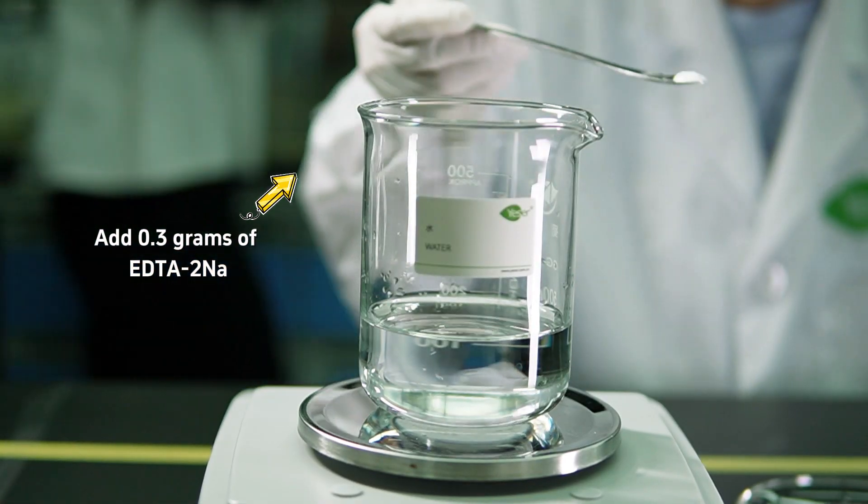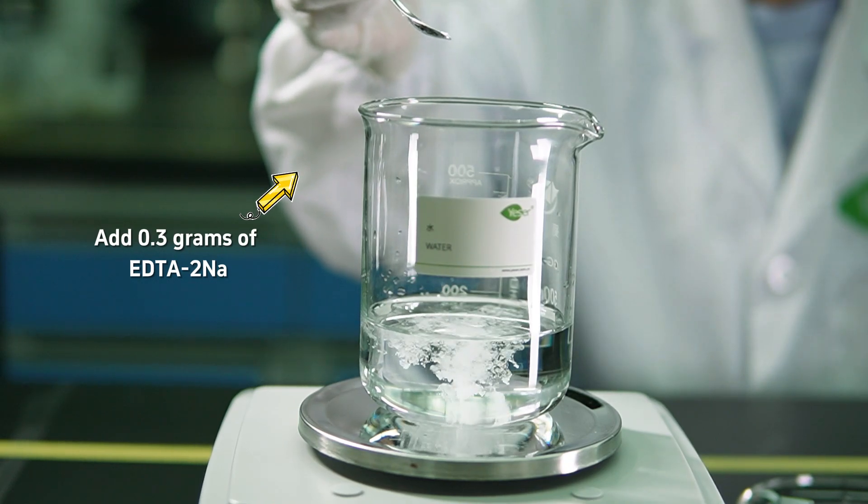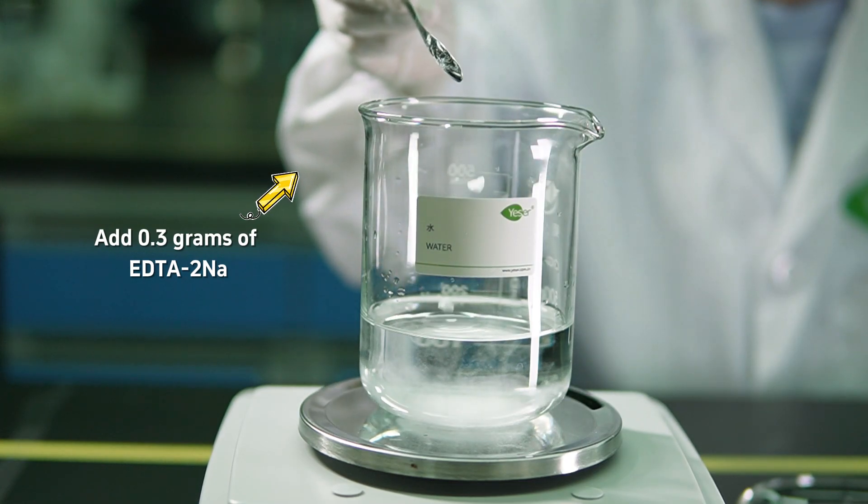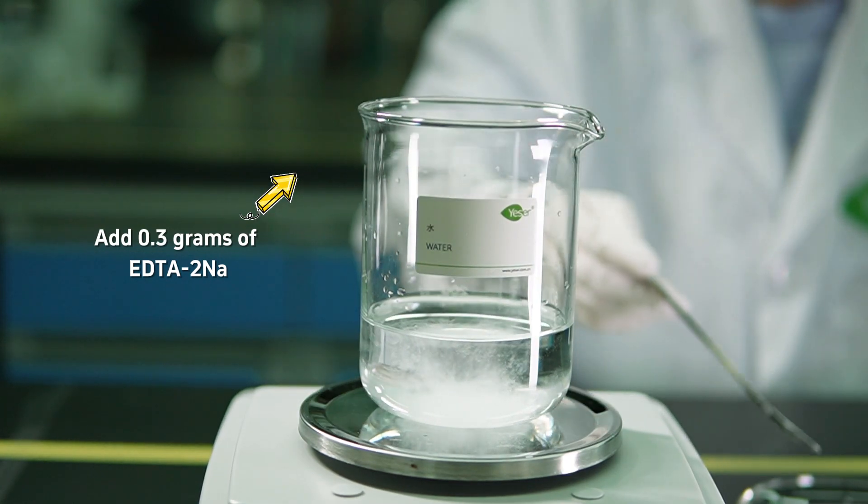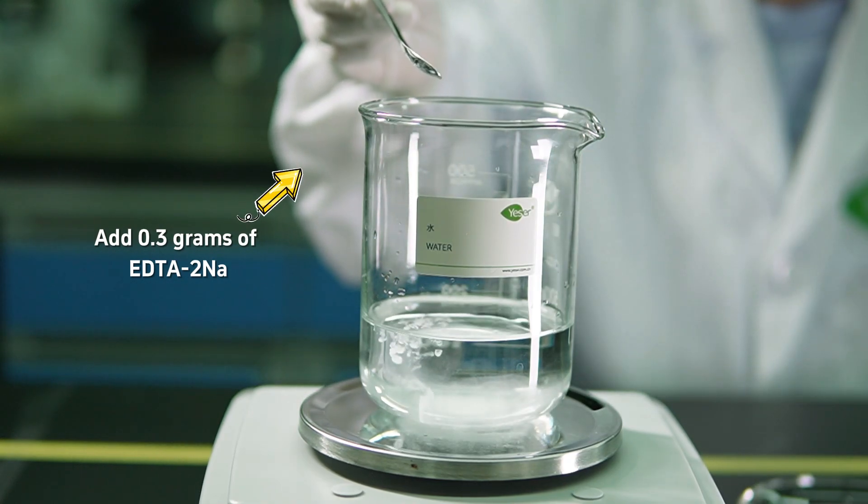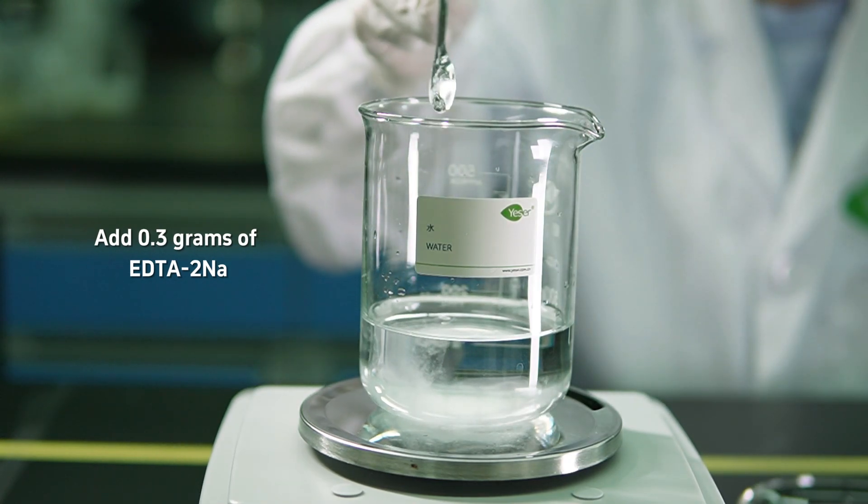You know, the stuff in hard water that can mess with our surfactants, and it keeps them out of our way. This ensures our bath gel can really lather up and do its job properly. But the magic of EDTA-2Na doesn't stop there. It also features outstanding sequestering ability and bacteria-inhibiting ability to improve the stability of the products and increase their shelf life.